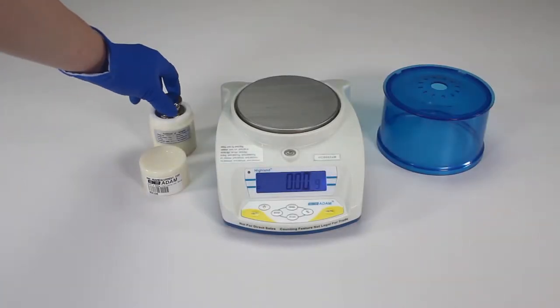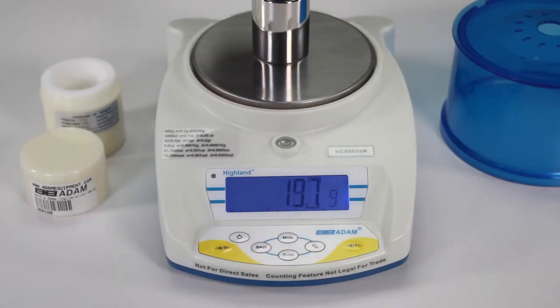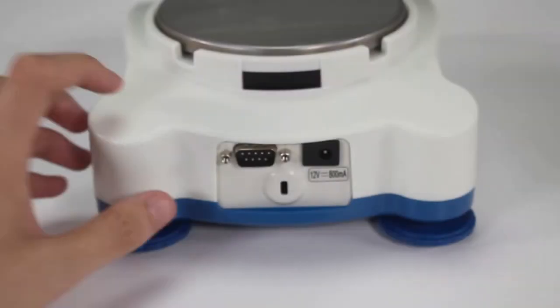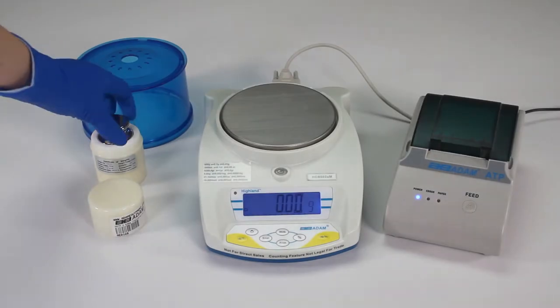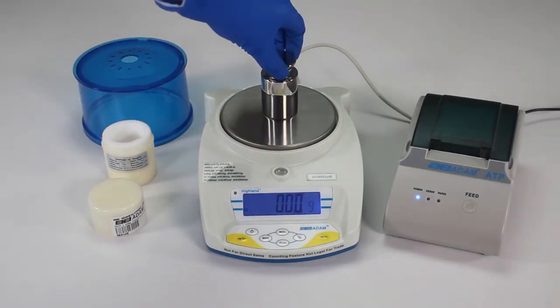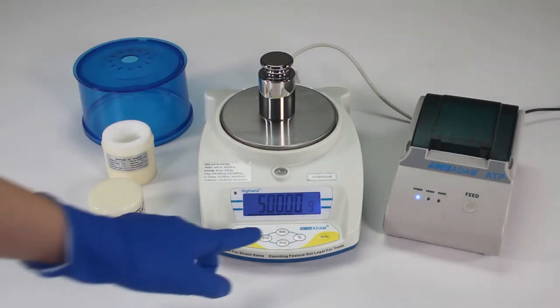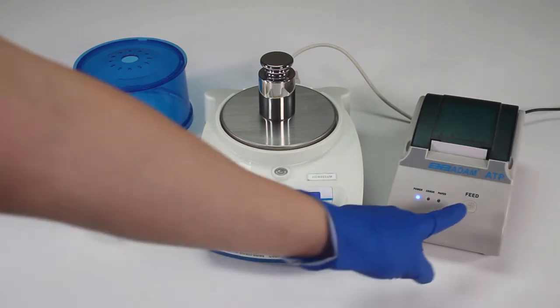Approved Highland models are available with capacities up to 5000 grams. Data communication is easy with the included RS-232 and USB interfaces. This means you can quickly transmit your results to printers or computers.